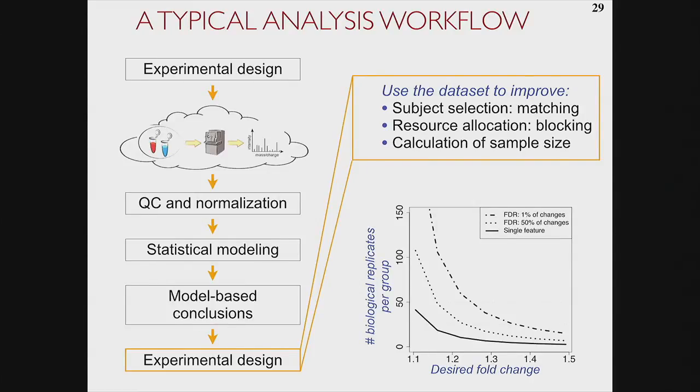Next time we have to repeat a similar type of experiment, maybe as a confirmatory study or as some other related question and so on. And typically MSstats treats every data set which is being analyzed, immediately, as if it was a pilot study for some other future experiment.